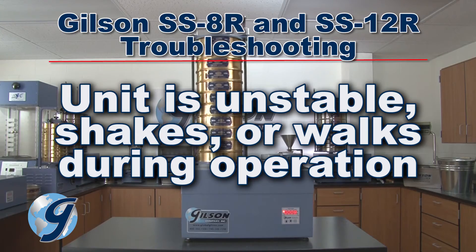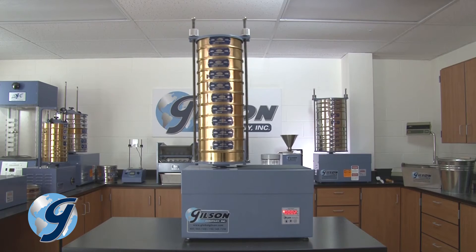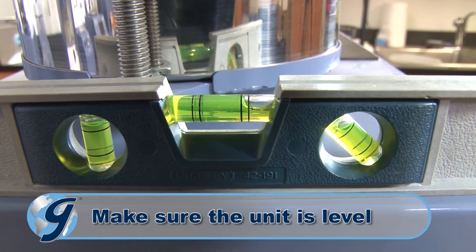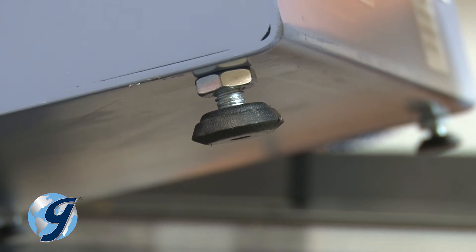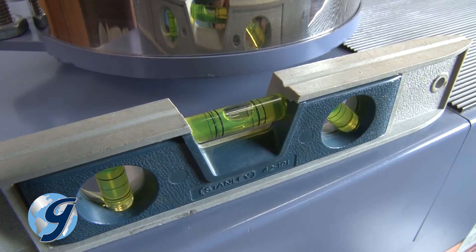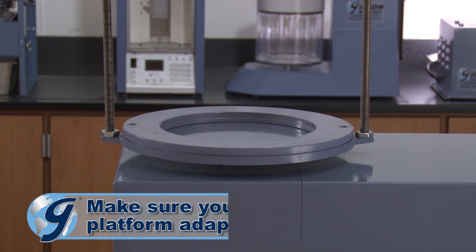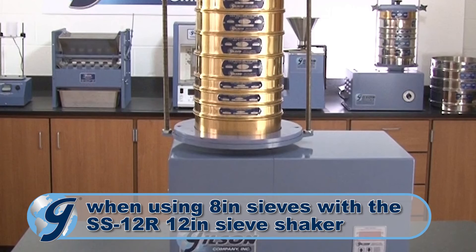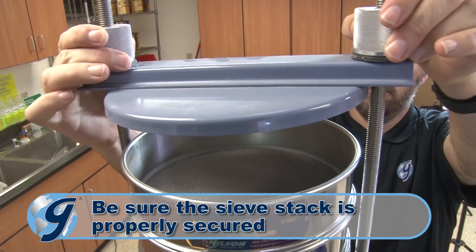There may be several causes if your unit appears unstable, shakes or walks too much during operation. First, make sure the unit is level. Properly level the unit by adjusting the leveling legs and then locking the legs in place with the lock nuts. For the SS-12R 12 inch tapping sieve shaker, make sure the weighted platform adapter is used when sieving with 8 inch diameter sieves. Be sure the sieve stack is properly secured by loosening and reclamping the sieve stack.